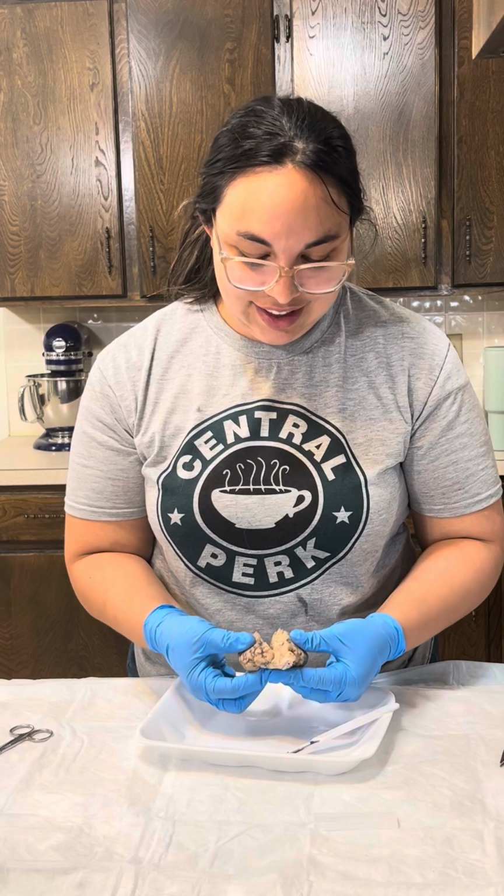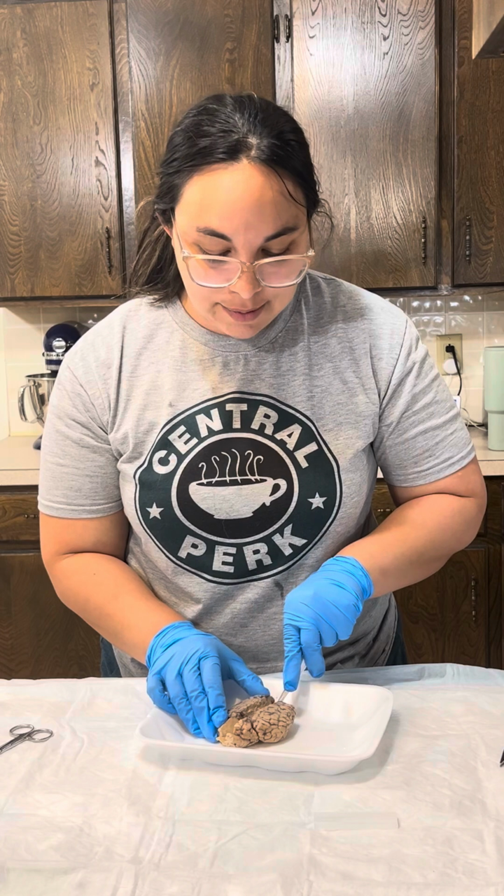Okay. All right. Do you want to see, Kai? Sure. I'm done cutting.